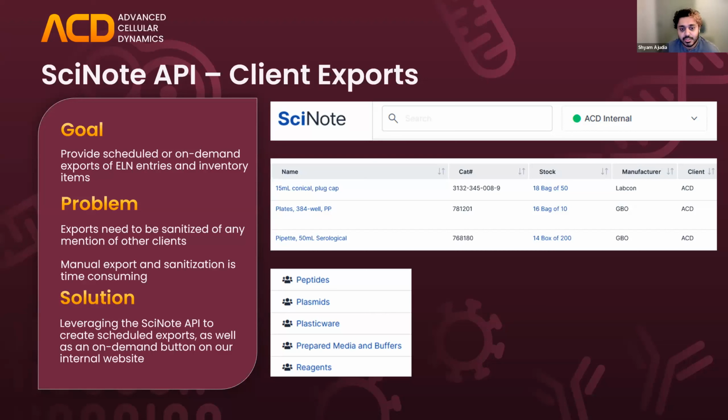So with the API, I have systems in place to either regularly or occasionally on demand, depending on the client, export inventory items of specific inventories that the client might need to see, and also export lab notebook entries, and then automatically sanitize all the data so they're only seeing their own information. There's no risk of showing them anything they're not supposed to see.